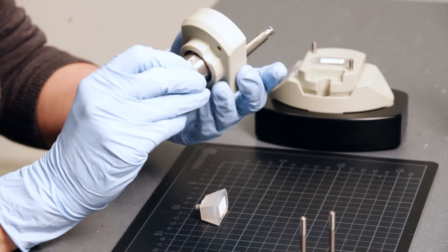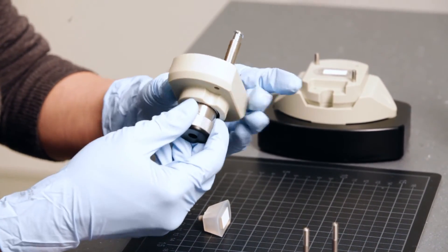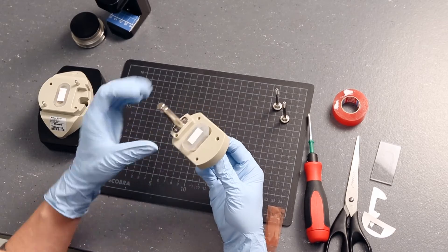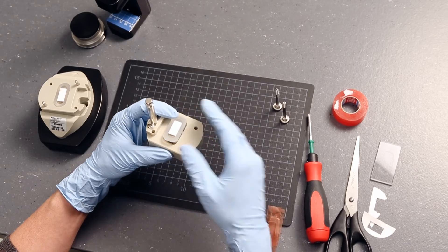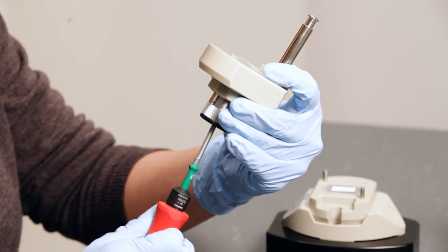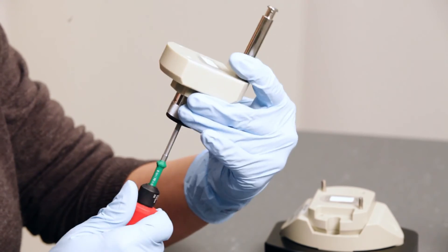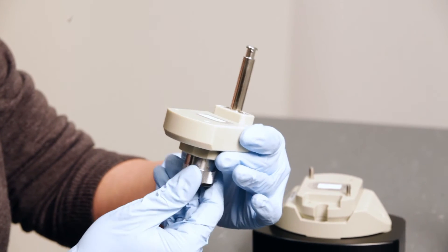Prepare the upper half of the measuring cell. Tighten the adjustment knob by turning it clockwise. Align the thread of the sample holder with the gasket and fix it with the screwdriver. Adjust the position of the gasket and the sample holder until the sample surface is flush with the cell.